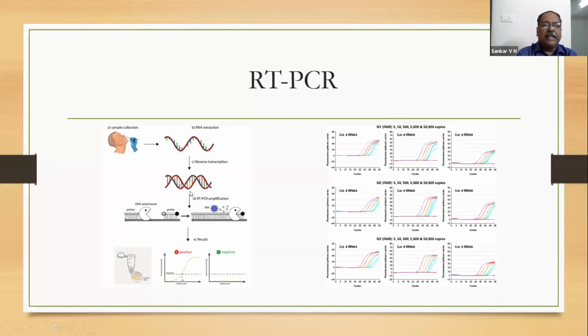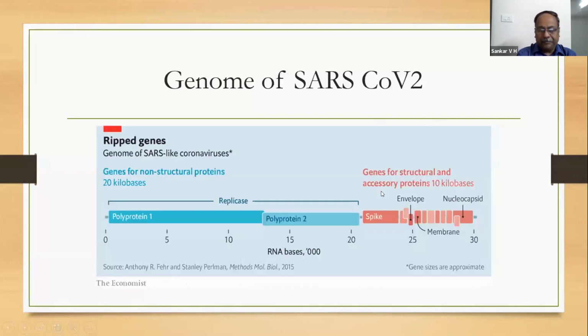Then it will be denatured, primers will be attached, and the area of interest will be amplified. Whenever there is amplification, that particular gene is present, and the gene will be amplified. The probe will be released from that. This probe will show a color. So in RT-PCR, you immediately get the color, which says that the positive result is there.